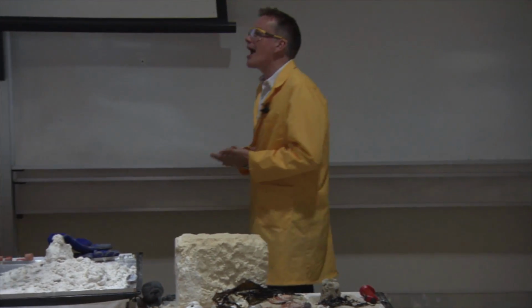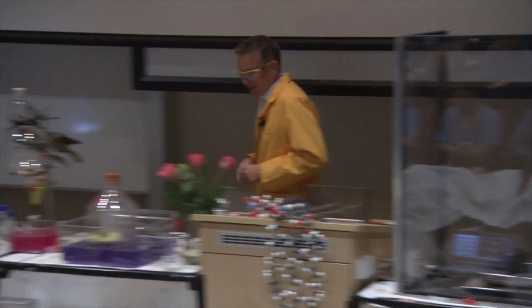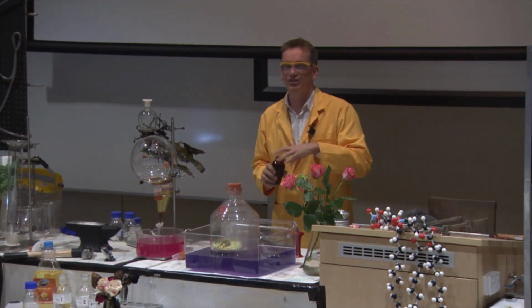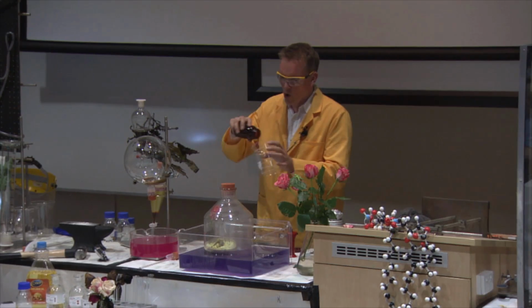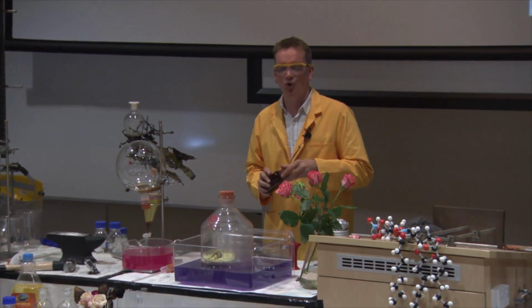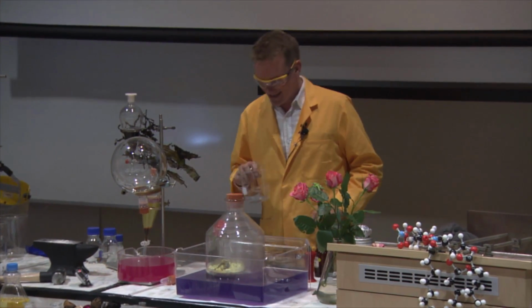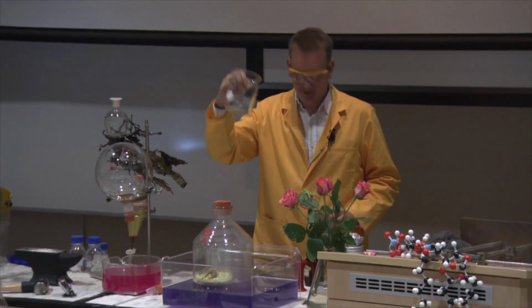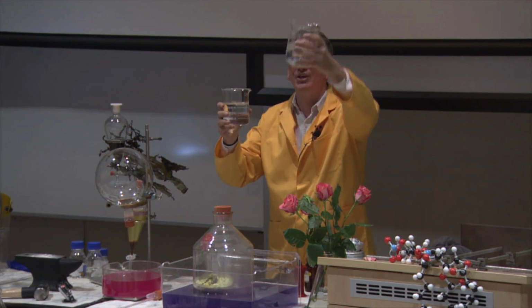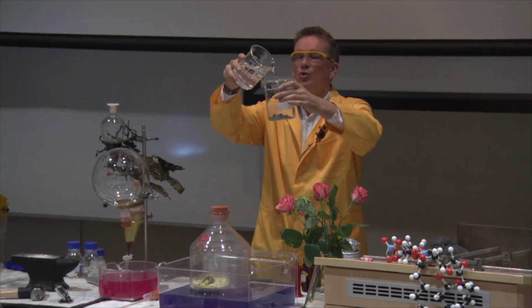Well, there is another way that we could make some calcium hydroxide, and that's starting from calcium metal. And I have some calcium metal over here. Actually, this is very old calcium metal, so I can use it up for this. It's been in their stores here for tens of years. Okay, so it looks almost metallic-like. I'm just going to add some water to this. So this is my calcium metal. I'm going to add some water.